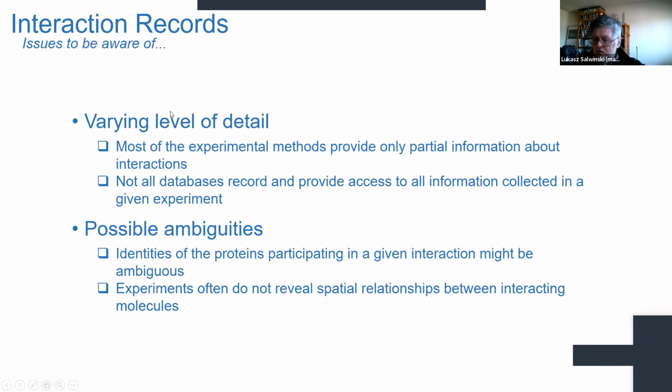Here are the issues to be aware of, just to recap whatever I was mumbling for the last half an hour or so. So here are things to be aware of. One thing to remember is that depending on the experiment, there are going to be different bits and pieces of information present. So this is something to be aware of.